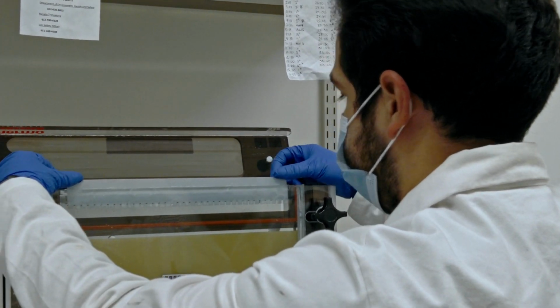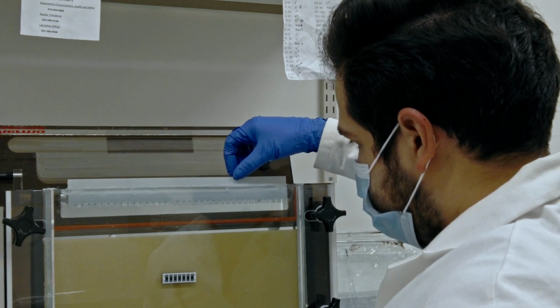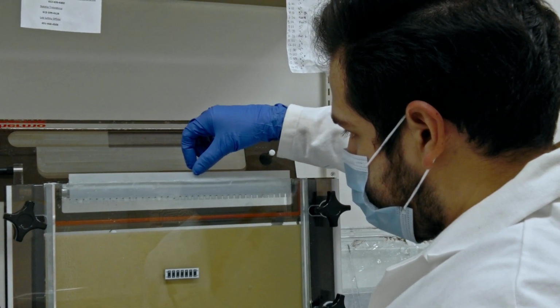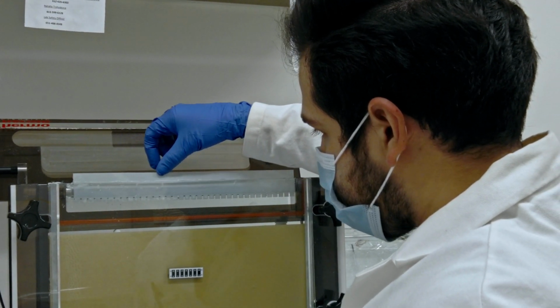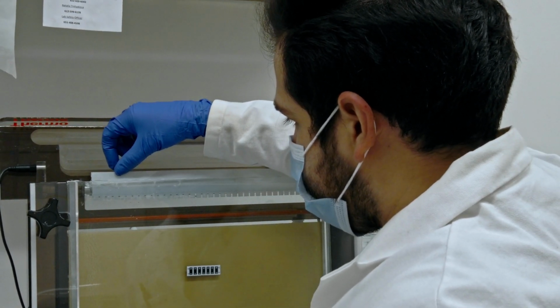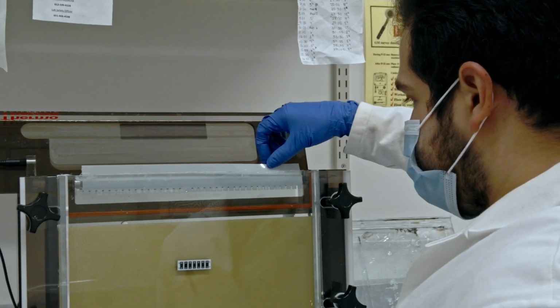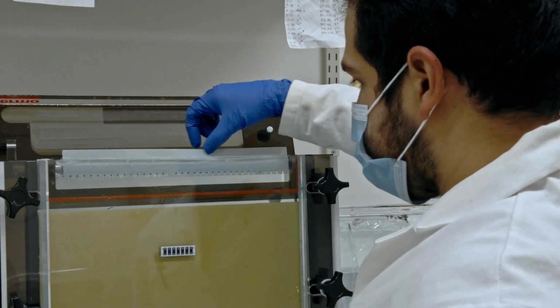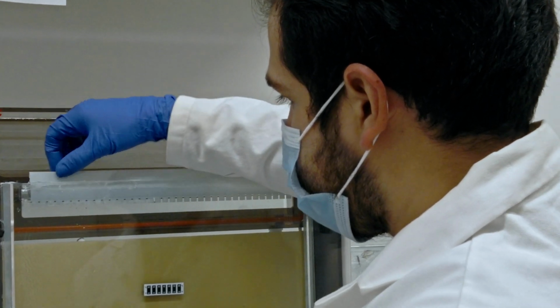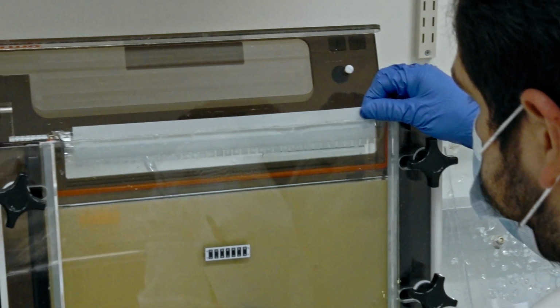So the best way that I'm going to try is to slowly peel back here. As you can see, as I push the comb, you can see some of the buffer that I added slowly filling into the front and might get into the wells itself. That kind of helps me loosen up some of the comb. Next, we're going to slowly lift it out here from one side, then the other as well.